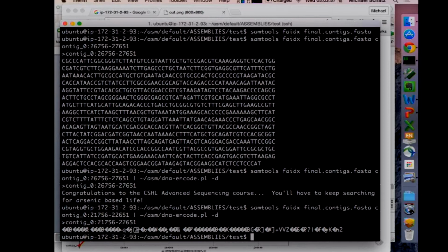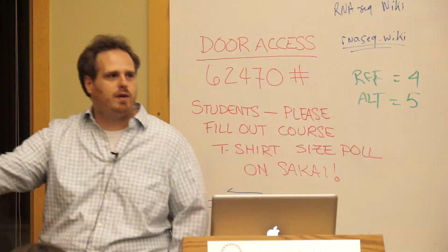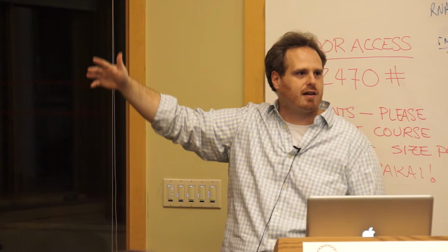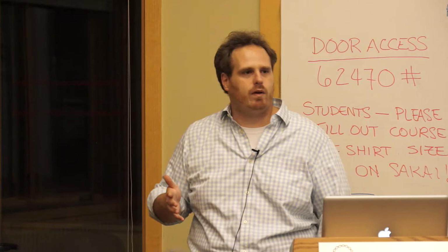Okay, so are there any questions about what we did? The slides with all the commands we ran are present, along with the installation instructions for all paths. Mummer is very easy to install. It's on SourceForge. It takes 3 seconds to build it. But are there any questions about the concepts we went over today?